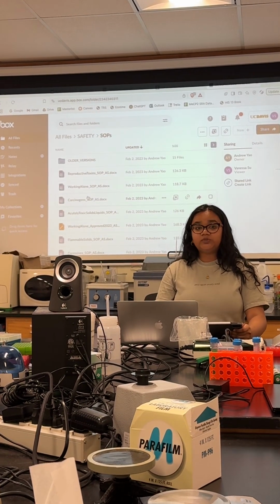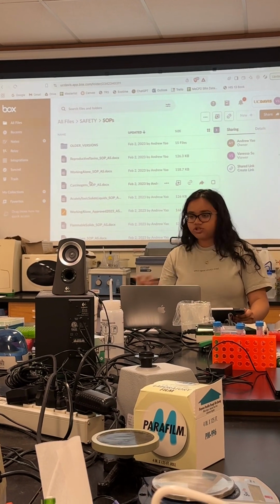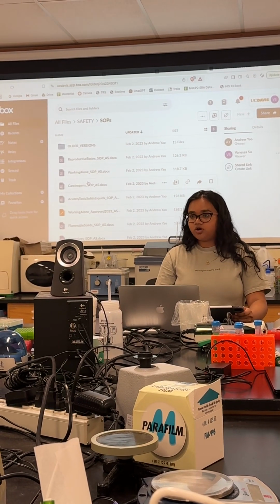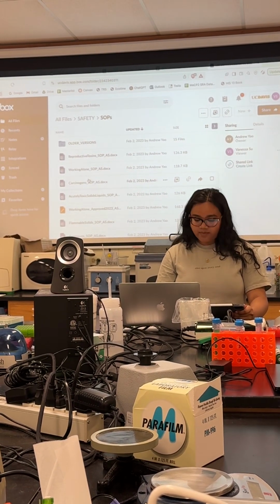That's totally okay. SOP stands for Standard Operating Procedure. So standard operating procedures are just like what it sounds. Certain chemicals and processes are more dangerous and require extra training. So these trainings are called SOPs, Standard Operating Procedures, and they're given only by Andrew, who's our lab manager.